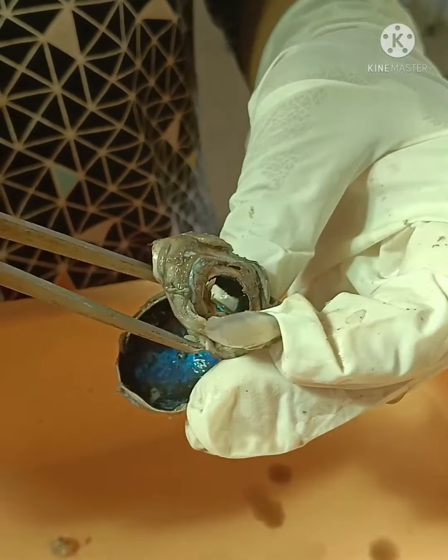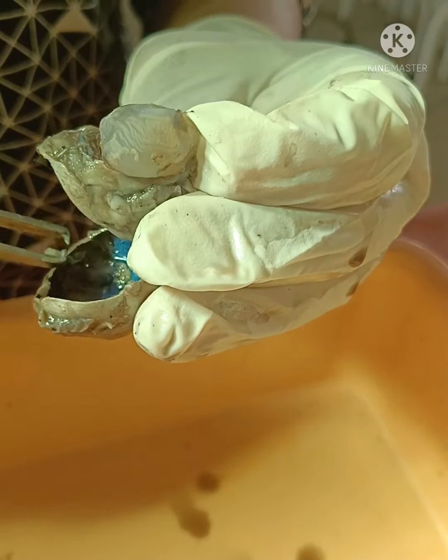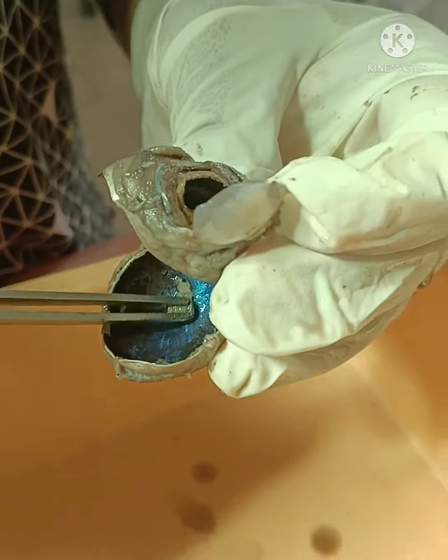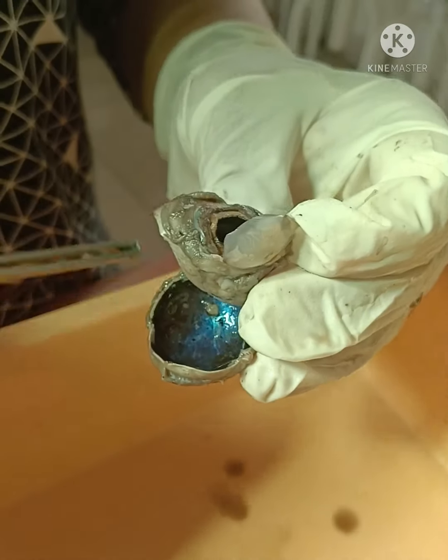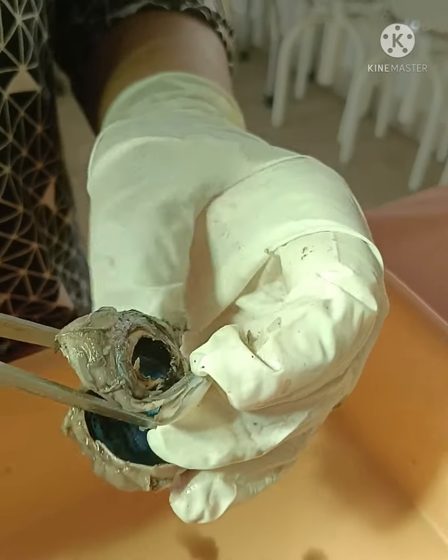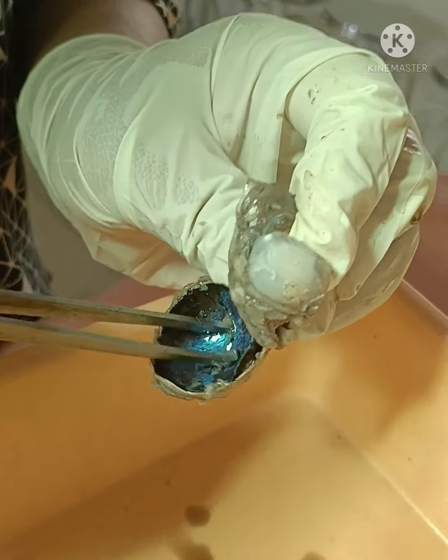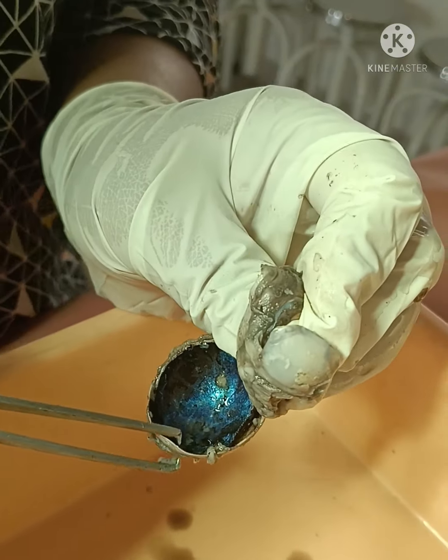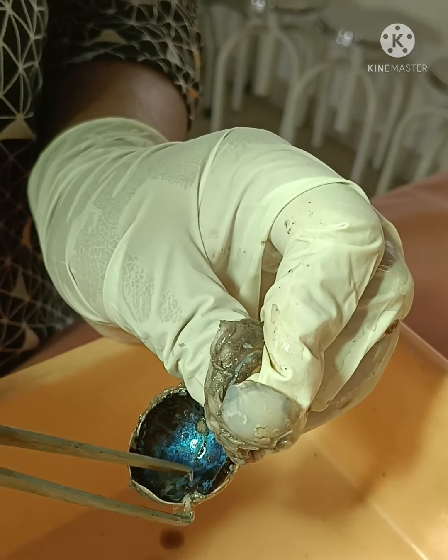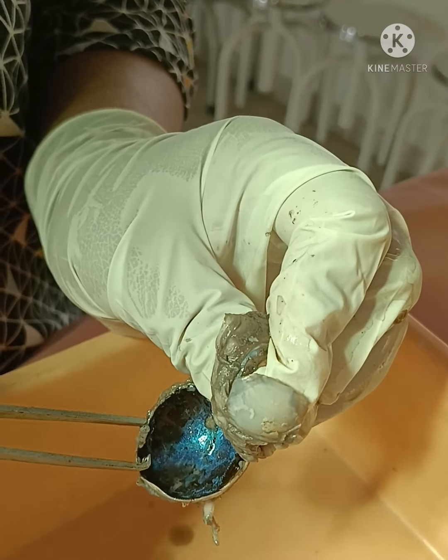The retina continues anteriorly up to the ora serrata, and posteriorly up to the optic disc. This spot is known as the optic disc, and from here we can see the optic nerve emerge outside. At this optic disc, all the layers of the retina terminate, and we call it the physiological blind spot.